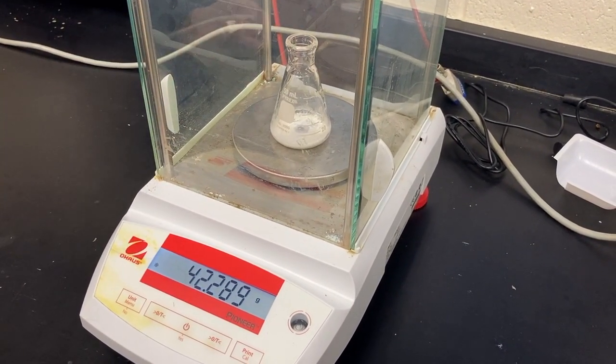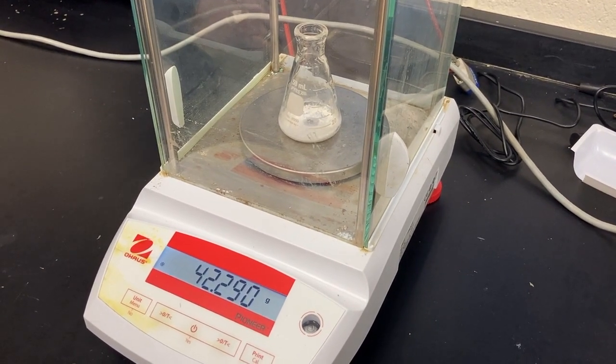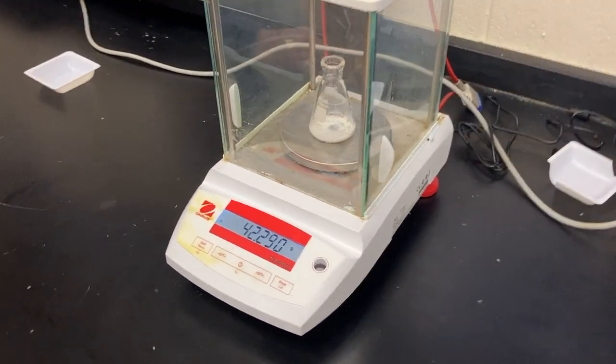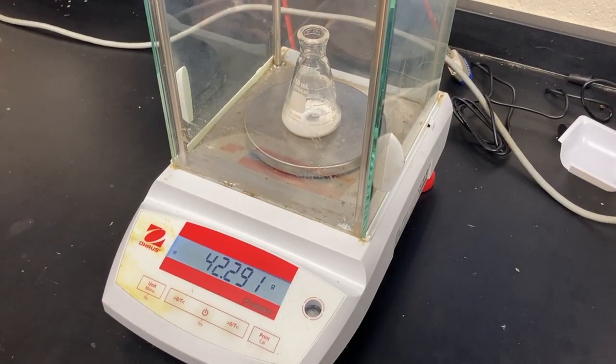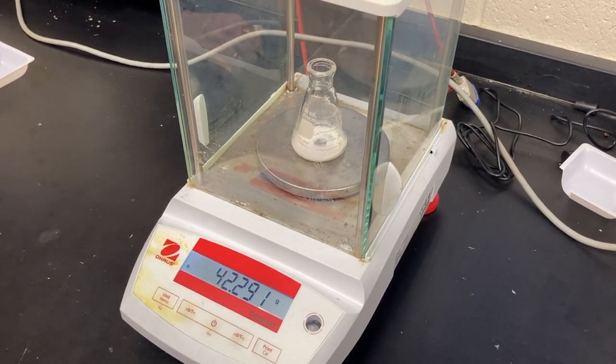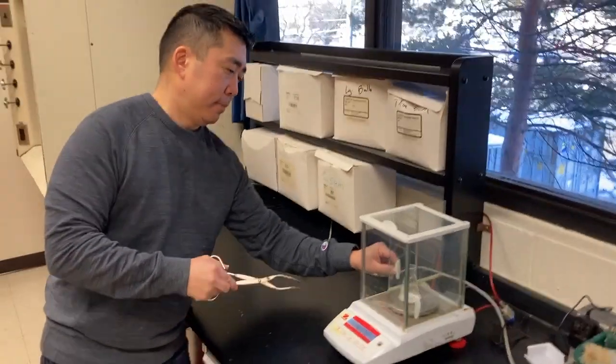Okay. So 42.290 grams. Well, we only started with 0.2 grams of magnesium. Well, that's a huge mass. That includes the mass of the flask. Oh. And that's why we weighed the flask empty, silly, at the beginning, so that we can subtract. Great.